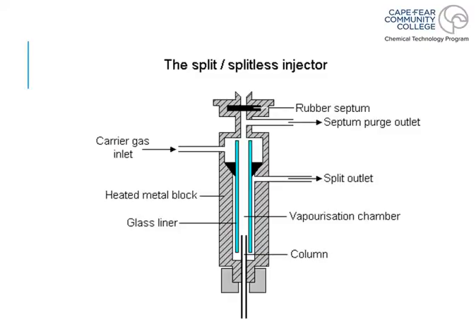You'll also see another diagram that's a little bit closer up, maybe some more detail. And here you really do see the different pieces and parts. So up here at the top is the round injector port, and your needle will come in from this side, and it will be inserted into the injector itself.